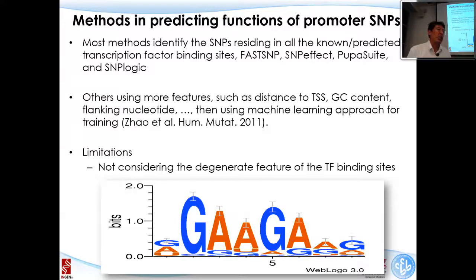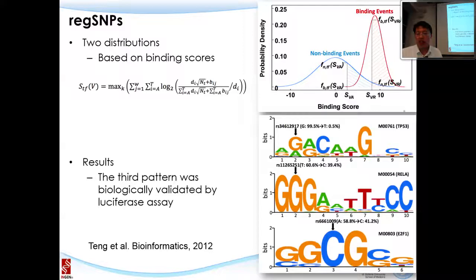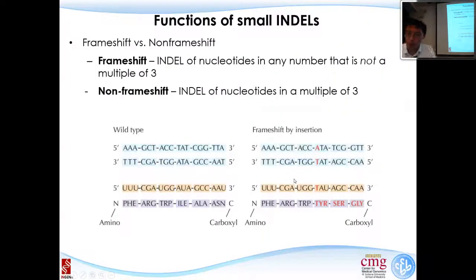After we identify the transcription factor binding, after the experimental consideration, we have to look at the transcription factor binding efficiencies. I'm not going to go into detail on this. This is another of our papers. Basically, in this paper, we're looking at the disruption of those binding matching score calculations, and this is the results. For one of the studies, we found those are the variants being targeted that we need to pay more attention to.